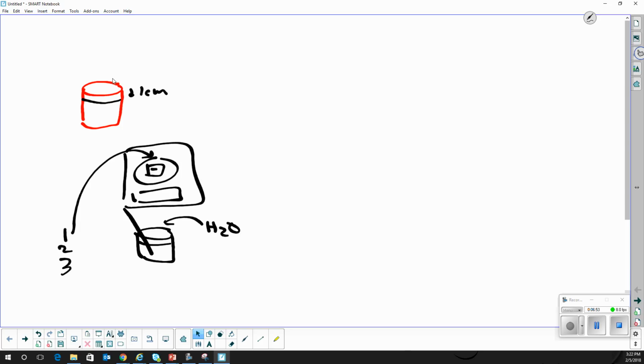And you're going to write in your lab what it looked like, what it smelled like, what it tasted like. 10 being the perfect Kool-Aid, 0 being not even close. Okay, then you're going to dump that out. You don't have to drink the whole thing if it's nasty. You can dump it down my sink, but do not dump it anywhere in my garbage cans, just in the sink. Then you're going to weigh again the same cup.